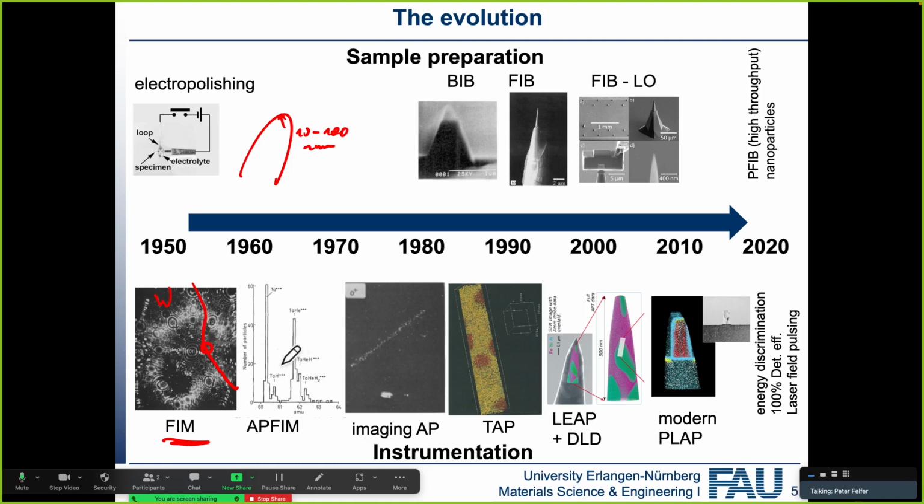And this is important to bear in mind, because very often if you try to do the experiment, people will look into old papers and just use the experimental conditions from back then. But depending on what instrument you're on, they might have a very different meaning. So very often one setting that we use is a so-called detection rate, which just says how many atoms we detect in each pulse. And typically we detect 1 ion every 100 pulses, roughly.